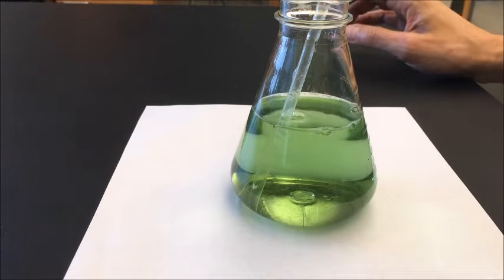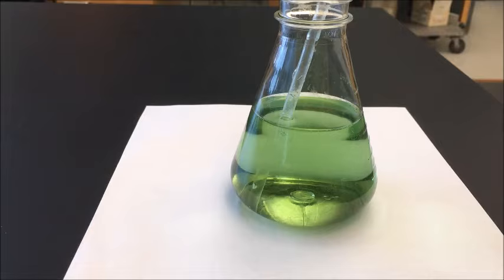Okay, so you can see the color change. Again, carbon dioxide is an acid, and bromothymol blue will react in the presence of an acid, and so that's why it turned colors. So now, what am I going to do with this bromothymol blue and this carbon dioxide? Well, let me pause the video and I'll show you what's next.